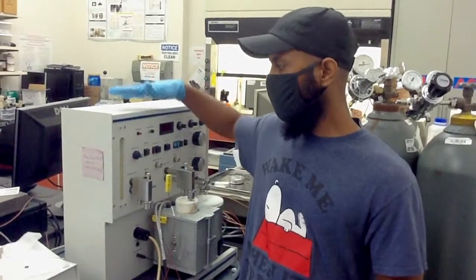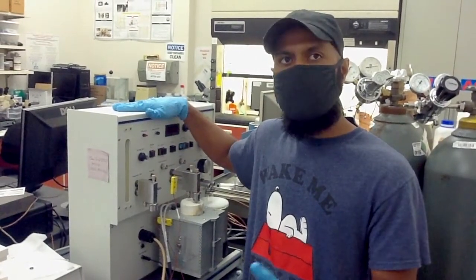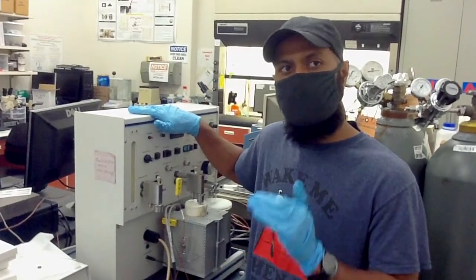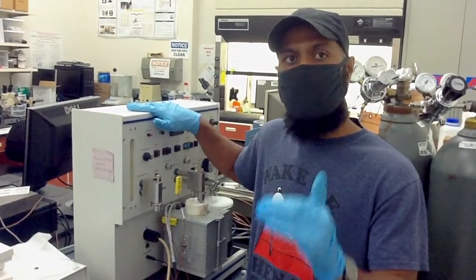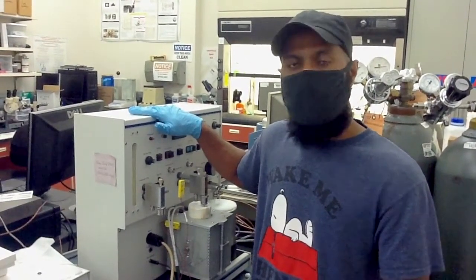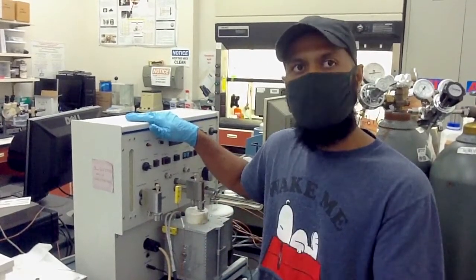So this chemisorption instrument we can use for different tests. If we name them, one is hydrogen TPR to measure the reducibility of your sample. We can use carbon dioxide to calculate the basicity of your material. We can use ammonia TPD to measure the total acidity of your material. We can use oxygen for temperature programmed oxidation of your material. And for this, you just have to change the gas to do the analysis, depending on what kind of analysis you want to do.